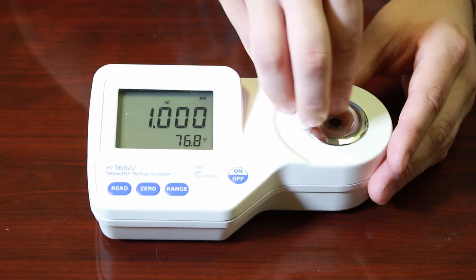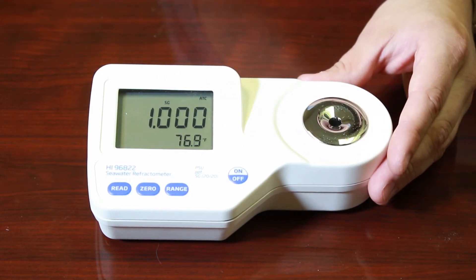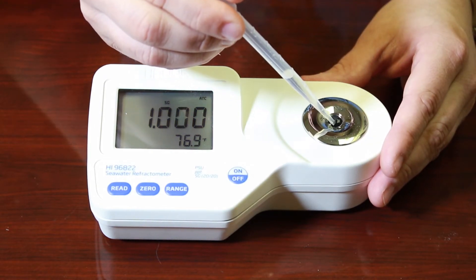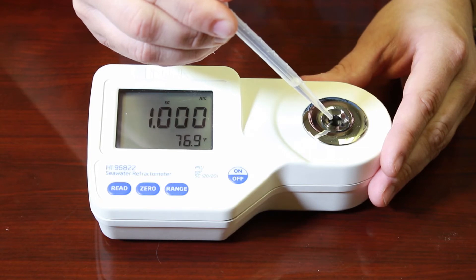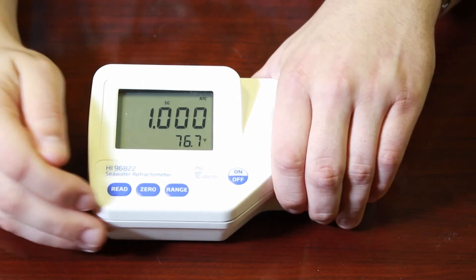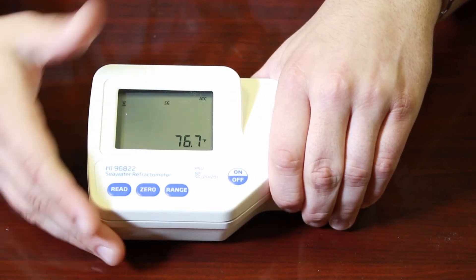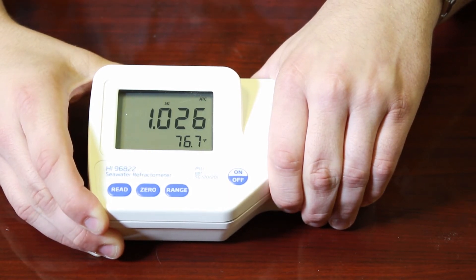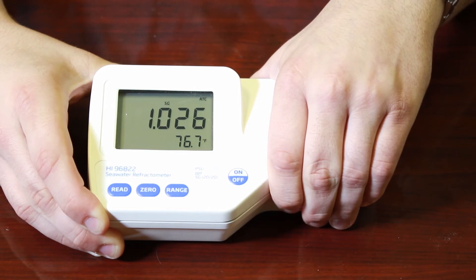Once the plate is wiped up and dry, take some saltwater and add it straight to the plate. Fill it up again and make sure there are no air bubbles. Cover the sample well again and hit read. You'll notice we get a salinity value of 1.026, which is a perfect salinity for our aquarium.